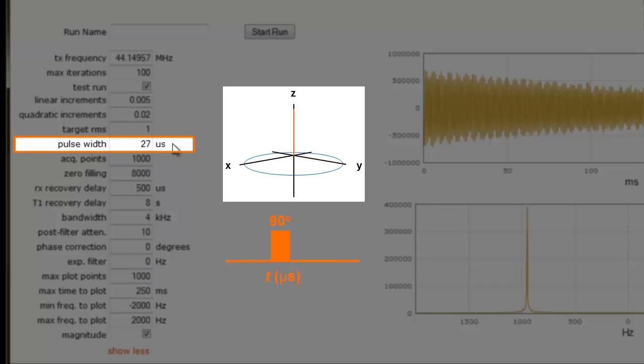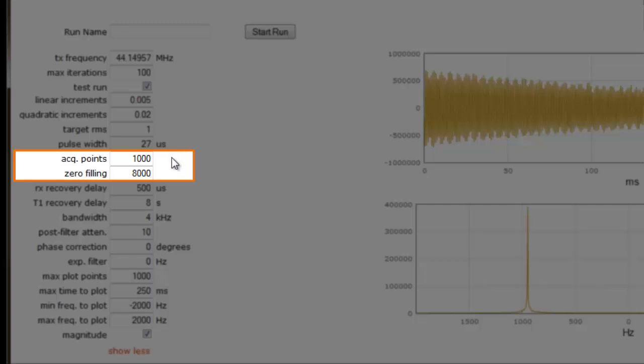Please refer to the test report documentation shipped with your instrument for the correct value. We're going to leave this value set to the test report value. After that, we have the parameters acquisition points and zero filling. Acquisition points is the number of points of the time domain to acquire.